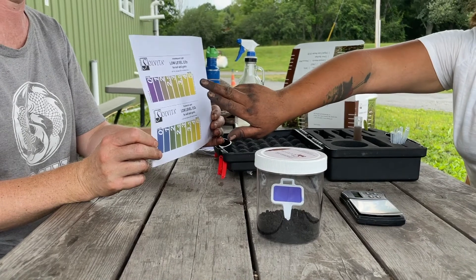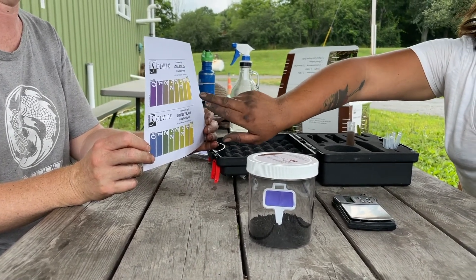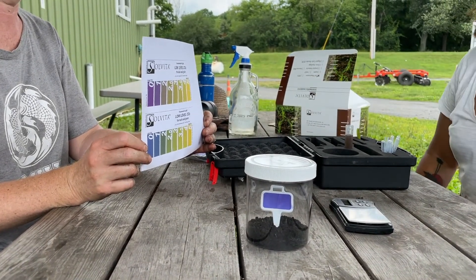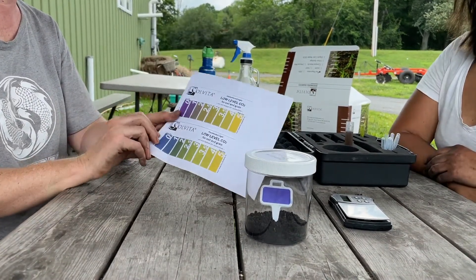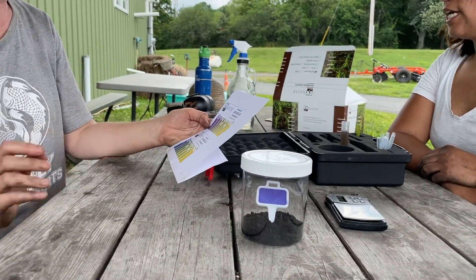After 24 hours, remove the probe and compare the color of the gel to the color chart included with the kit. Note the number that corresponds to the color and look at the interpretation table — Table 1 in the instruction manual — to understand your results. If the soil temperature when sampled was above or below 70 degrees Fahrenheit, adjust the results using the conversion factor found in Table 2 of the instruction manual.